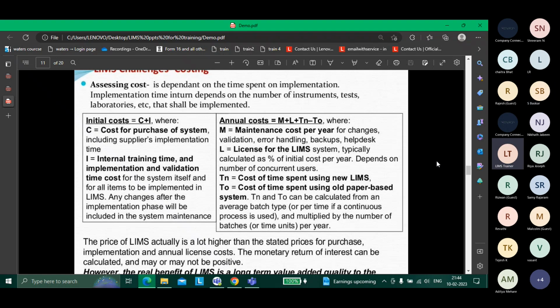User creation is basic, but what are the flags? Why are you creating this? Why are you doing this while creating a user? What is that master data? In which tables is that master data? Actually there are a lot of tables, but we'll try to cover a couple of those tables.